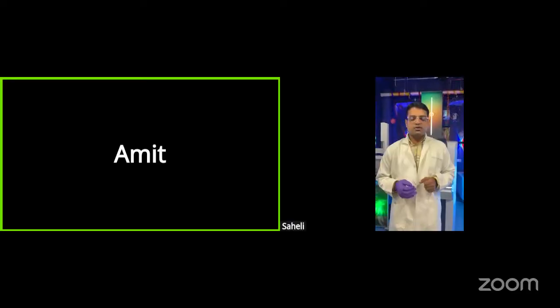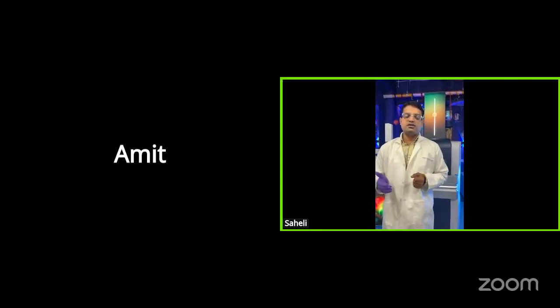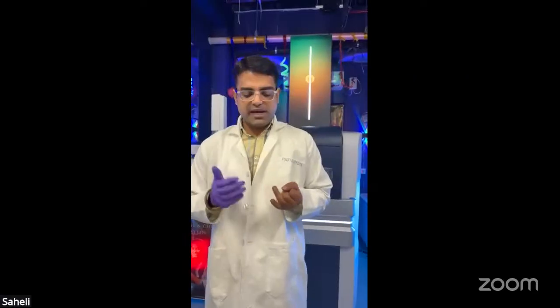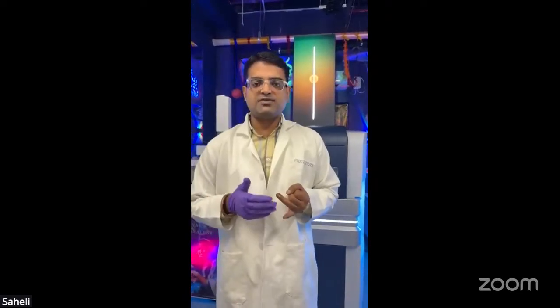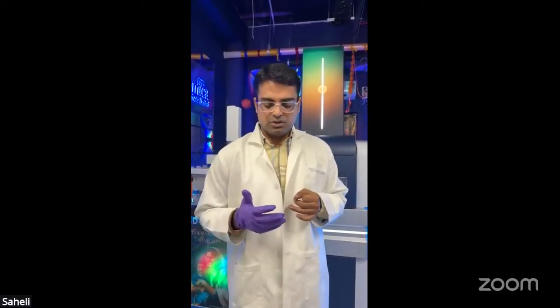So welcome everyone. What you are seeing is India's first TIMS facility here. Just to give a brief background, you have seen mass specs which can do a three-dimensional separation in the form of RT, m/z, as well as intensity. This is the first mass spec, the timsTOF Pro, which can do a separation on the fourth dimension, that is based on the cross-sectional area. So let's move on. I will explain that later.